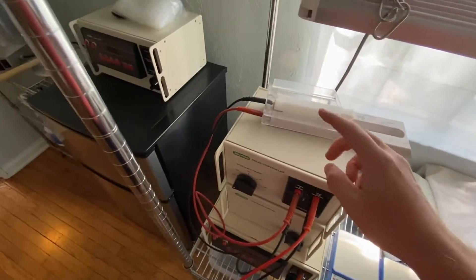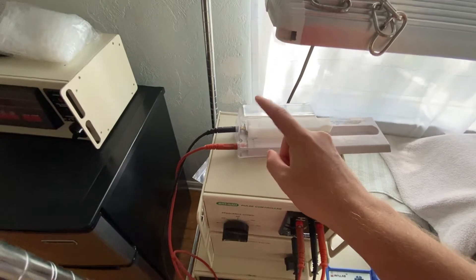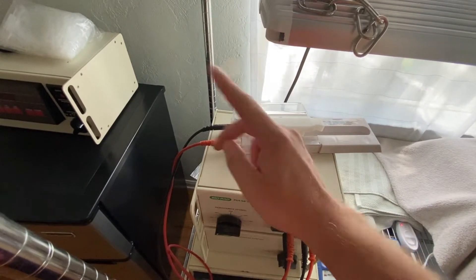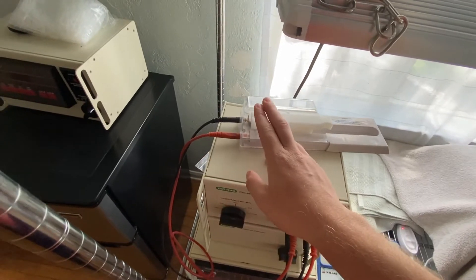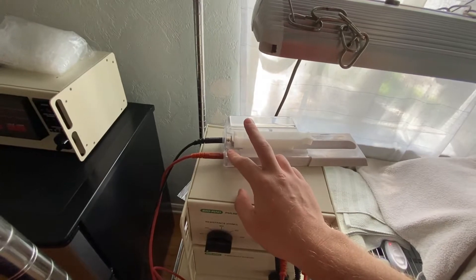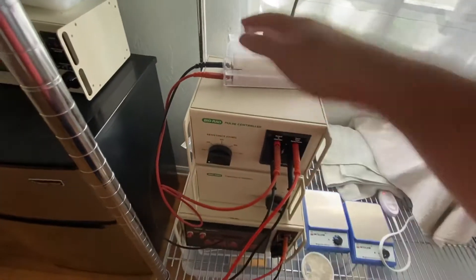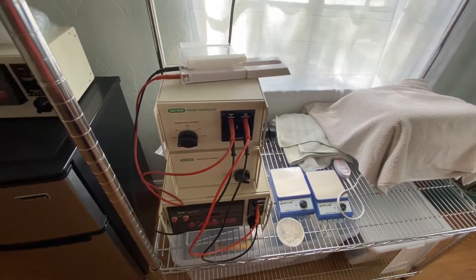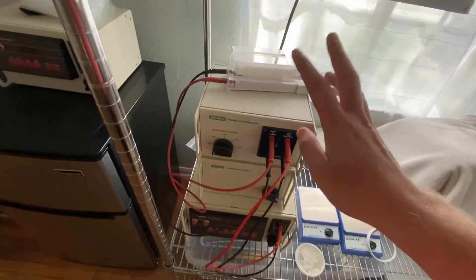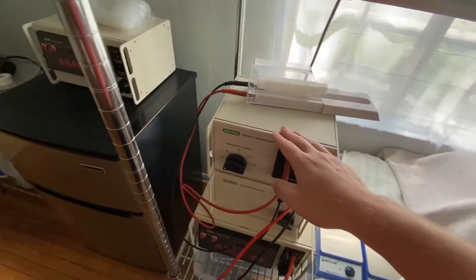You have to prepare the cells to get shocked, and that can take a while. You have to make sure the cells don't have any salt in them, because if they do, when you shock it, it can spark or explode — and it has exploded for me before. That will kill the experiment, kill the cells, and waste the DNA.